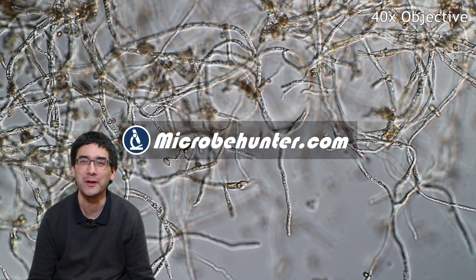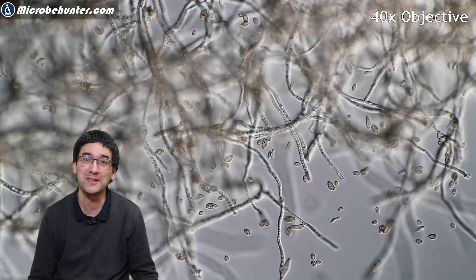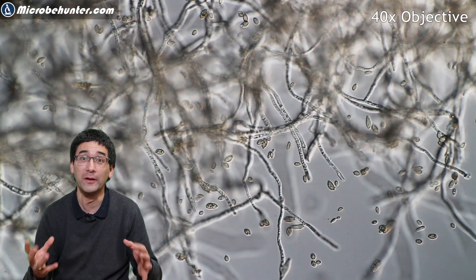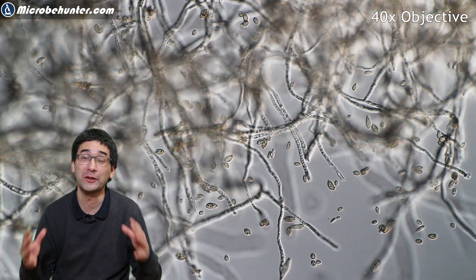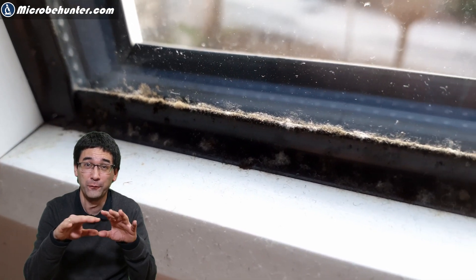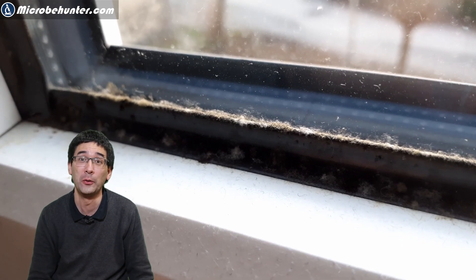Hi, Microbe Hunter here, and this is actually pretty disgusting stuff. It might not look very disgusting, but as a matter of fact it is. This is mold — a fungus I found growing somewhere in my room, in my apartment, directly on the window. You can see it almost looks like a little forest growing on the rubber insulation of the window.